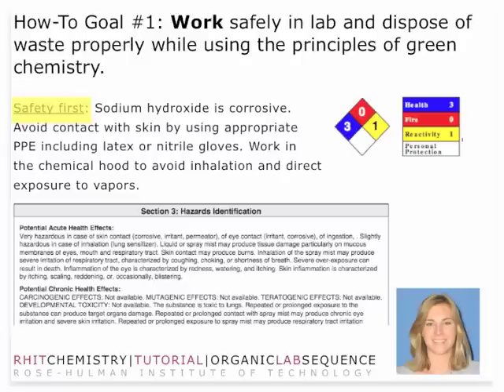You'll also need to make sure that you work in the chemical hood to avoid inhalation and direct exposure to vapors. The solids that you're going to be working with are organic solids — they're not salts — so they do have a marginal vapor pressure, and also the dust associated with any of those materials could be potentially hazardous. So work in the hood to avoid any of those direct exposures.